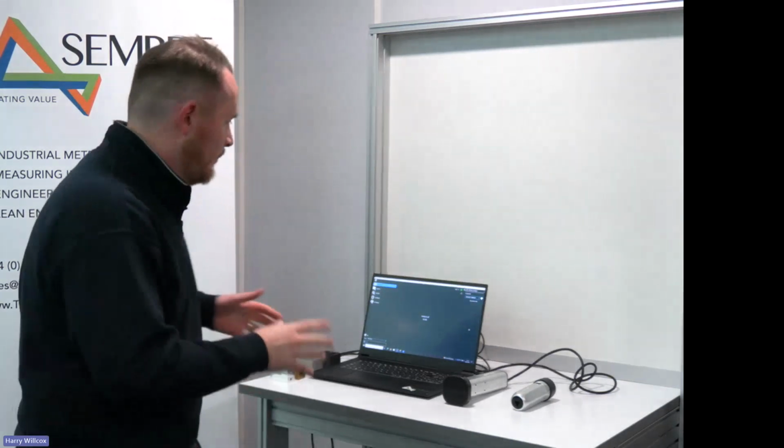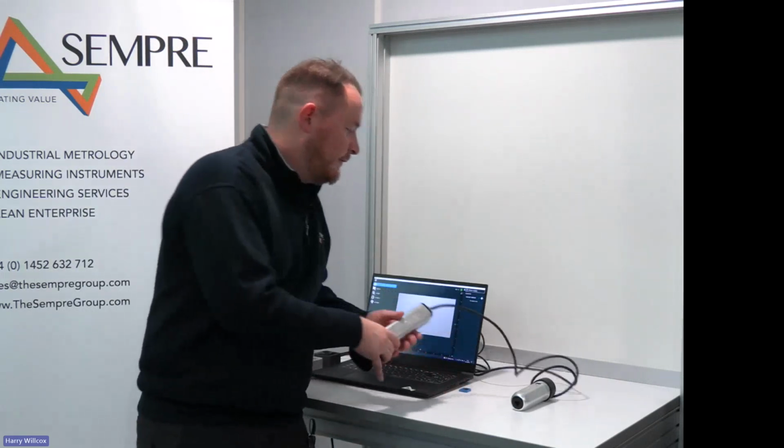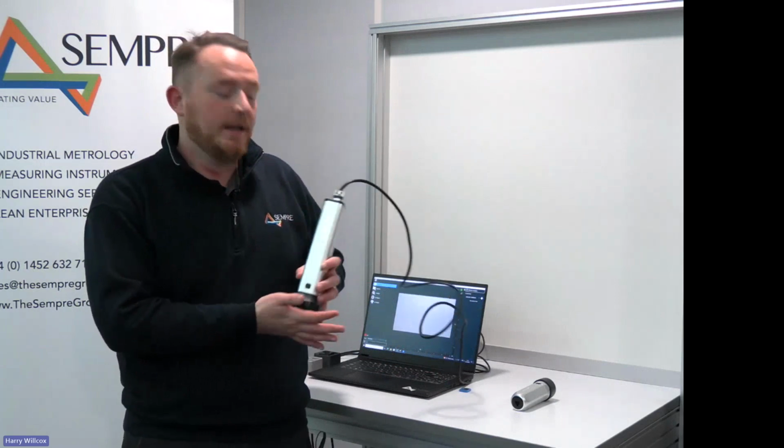So, there we go, you can hear me again now. A lot of information we just went through, and I can see there's been quite a few questions. So what we're going to do is run through a live measurement using the Gelsight Max. We're going to look at a roughness standard, and in one of the questions that we had, I'm going to be able to answer the question as we go through on the second measurement that we do on the Gelsight Max. The Gelsight Max, in comparison to the Gelsight Mobile Series 2, has a 16 megapixel camera, so you can see it's a slightly taller system.